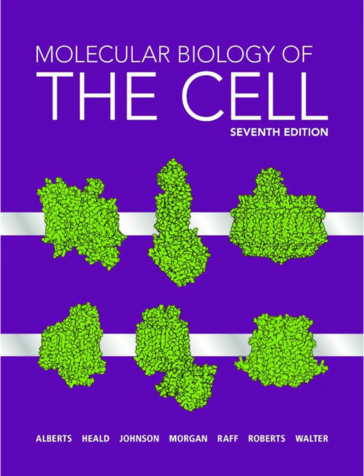Okay, so if fixing and staining cells can mess them up, lose components even, how do we look at them alive? That seems critical for seeing processes happen. It is absolutely critical. And that led to developing contrast-enhancing techniques that work on unstained living cells. Beyond just basic bright field, where light shines straight through, things like dark field microscopy, you shine light from the side, an oblique angle. Only the light that scatters off structures in the cell enters the lens. So you see bright objects on a dark background. It can be quite dramatic.